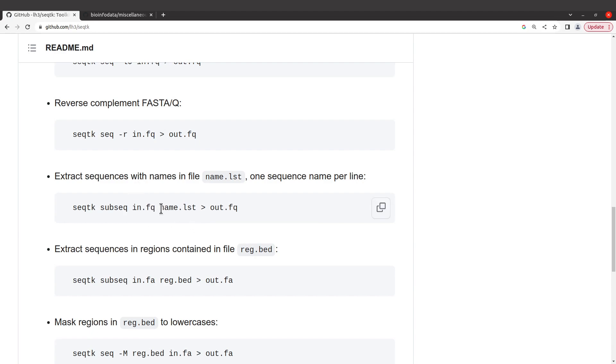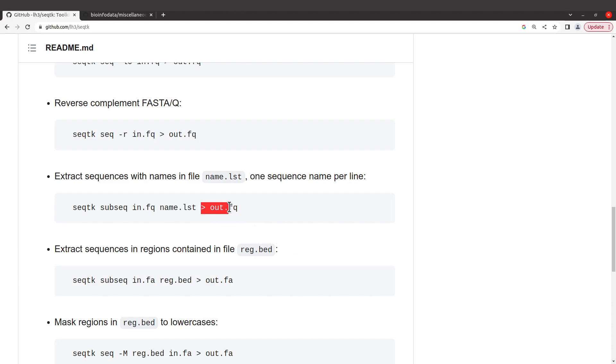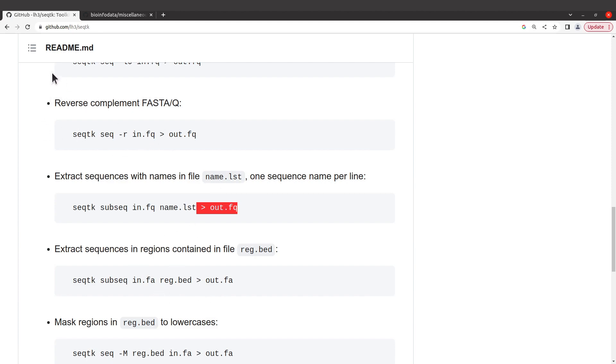You also need to indicate a file which contains the name or names of the sequences you want to extract. And then you need to indicate an output file. That's how we do it. It's very simple.